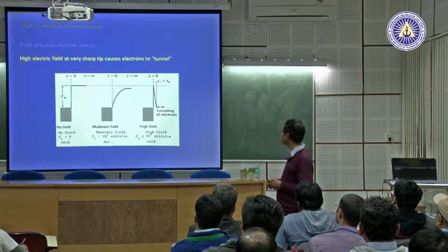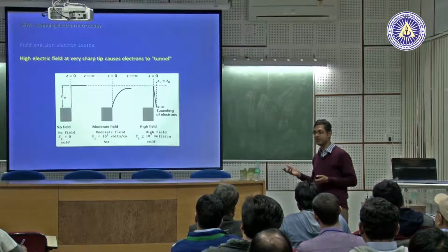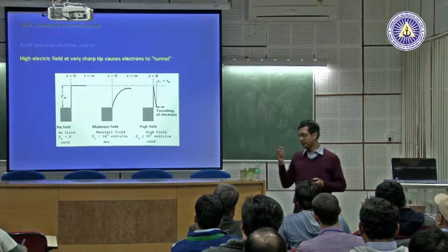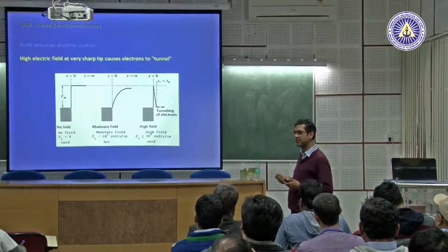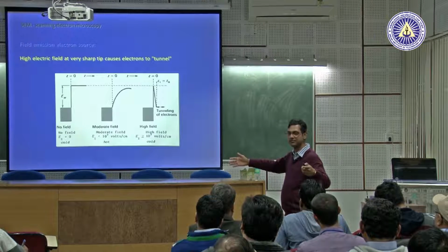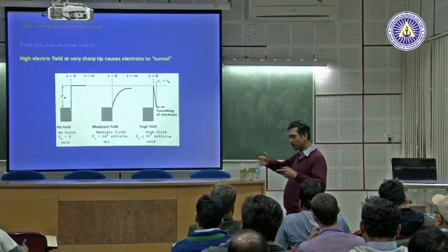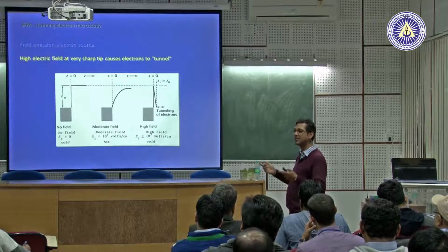In tungsten filaments, what happens? You are heating it up and you cannot heat the filament uniformly. Because of that, the electrons which come out will have different energies, correct? And because of that, the spread of the wavelength of electrons will be large. And as you know, as the electron wavelength spread is large, you have more aberrations because of the lenses. It's very simple.